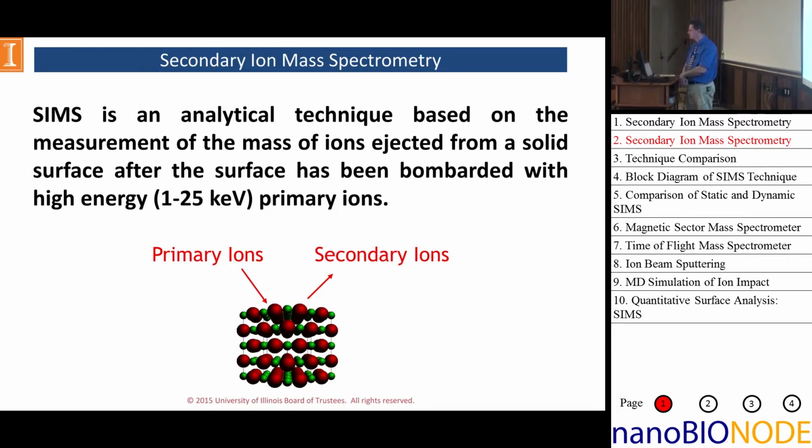You're looking at secondary electrons. Those are the electrons that come out. One of the nice things about SIMS is because we're measuring mass, the mass of the ions that are coming out, it allows us to examine things like isotopes and differences there, which you can't do with other techniques. The other thing I'd note is SIMS is complementary to AES and XPS, and it's very nice because we work in SIMS tend to be at the 1% and lower concentrations, where the XPS and AES are 0.1%, 1%, and higher. So you can start with one and then work your way to the other.